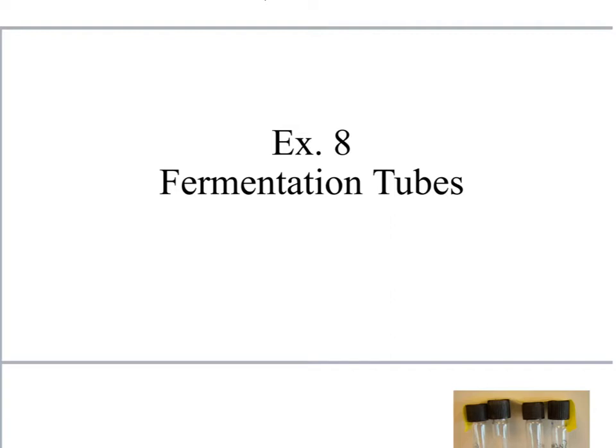But in this lab, we're going to focus on the use of carbohydrates for energy, and we'll see that there is a variability among bacteria as to which sugars they can use and which ones they can't. So we often look at this, especially in gram-negative organisms, as a way to identify organisms. Oh, this one can use sucrose and this one can't, for instance.